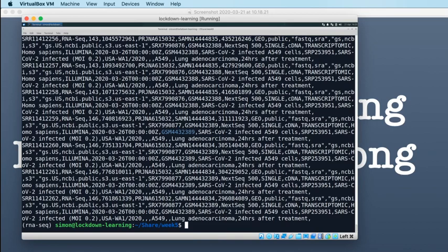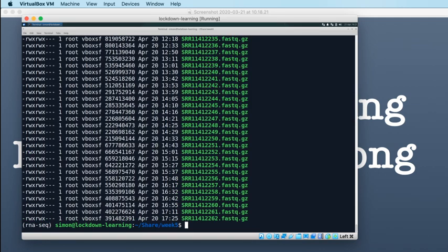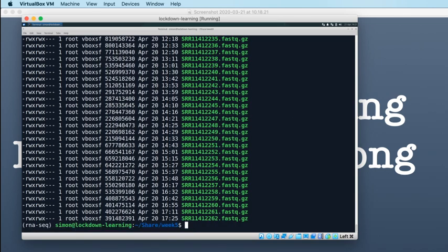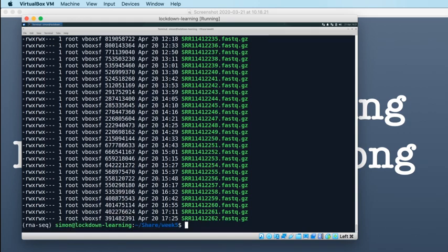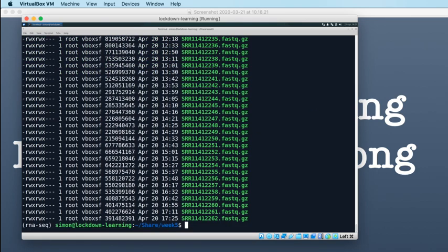I see a few people saying, why have they got less data than me? If you don't have the same amount of data as I have, so if your directories are smaller than mine, there's a couple of things I would check. I would check byte for byte. This is the size of these files byte for byte, and I can put a copy of this onto GitHub after the lesson if people want to check, because these human readable summaries are not accurate enough. There's going to be rounding errors in there, although obviously a discrepancy between 22 gig and 30 gig is probably too big a discrepancy to ignore. So you can check byte for byte the sizes of the files. That's as close as we're going to get.